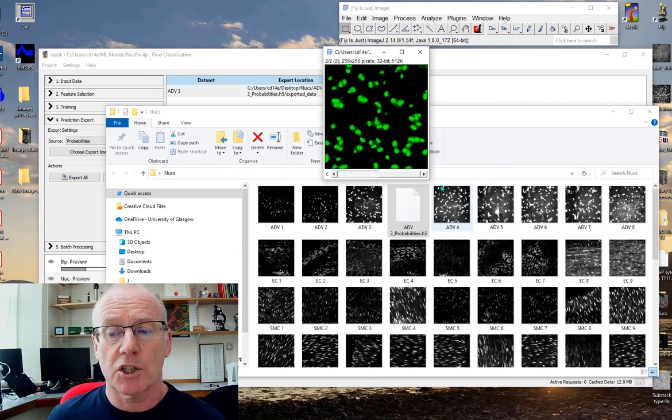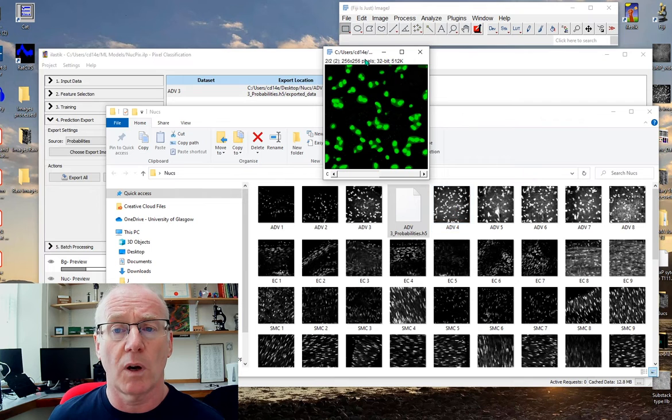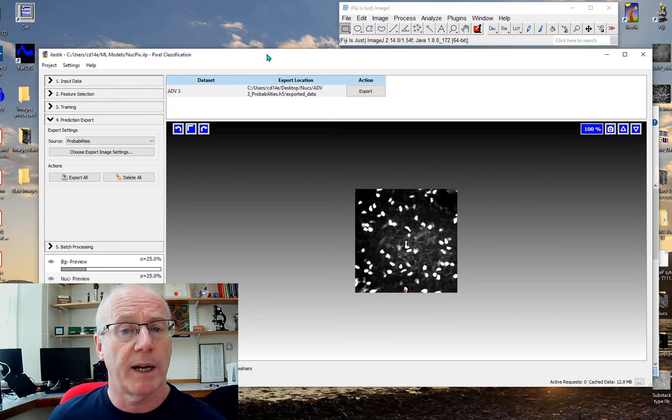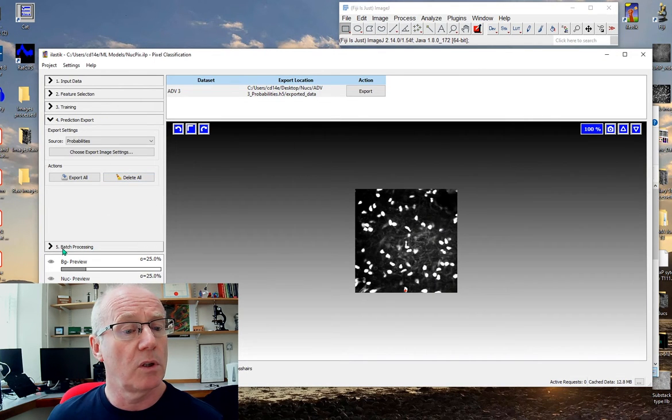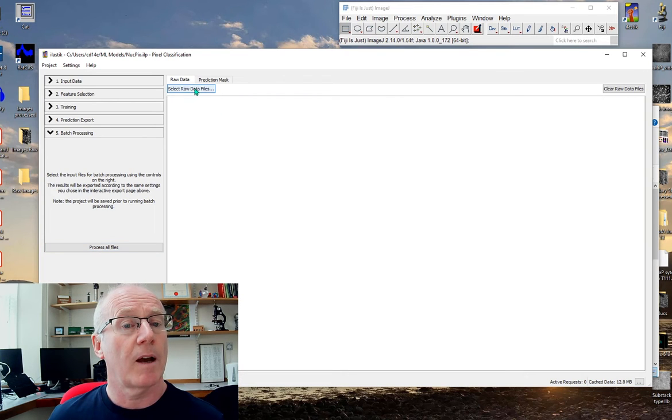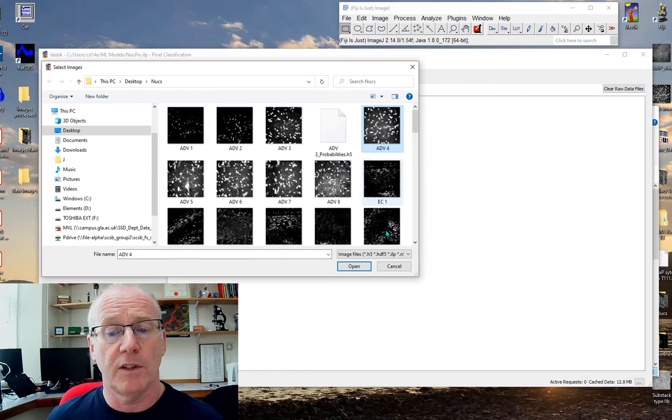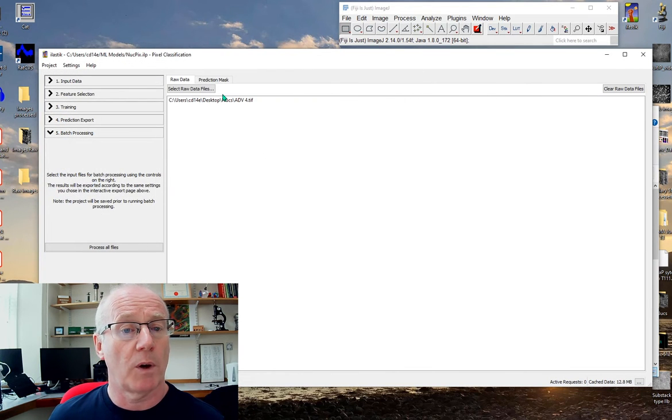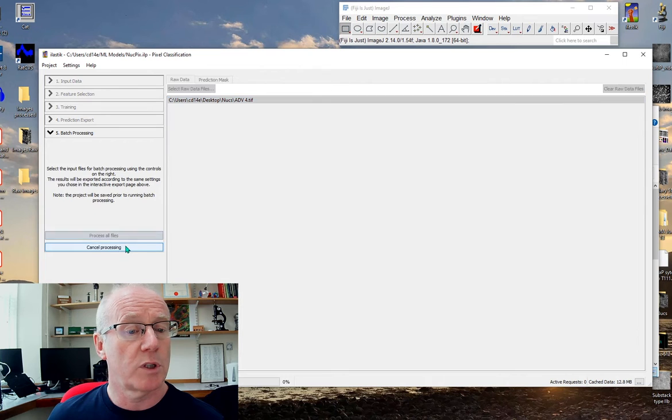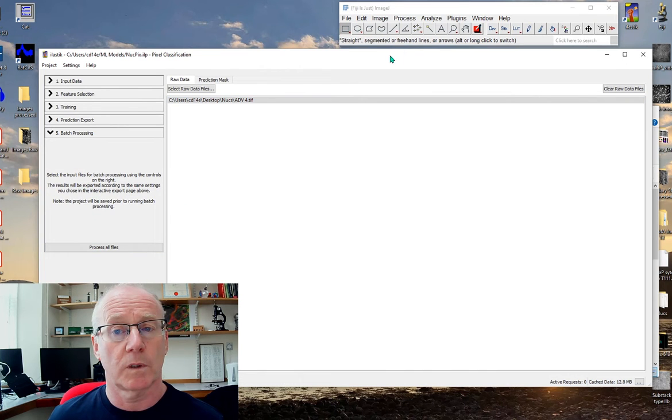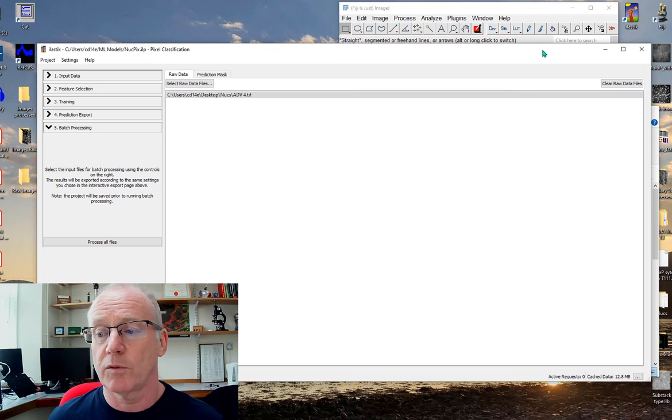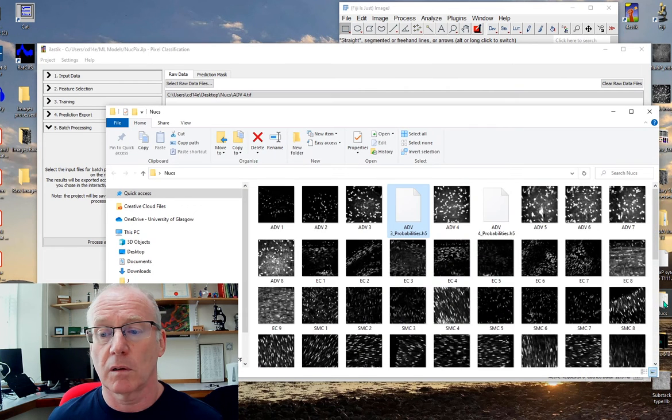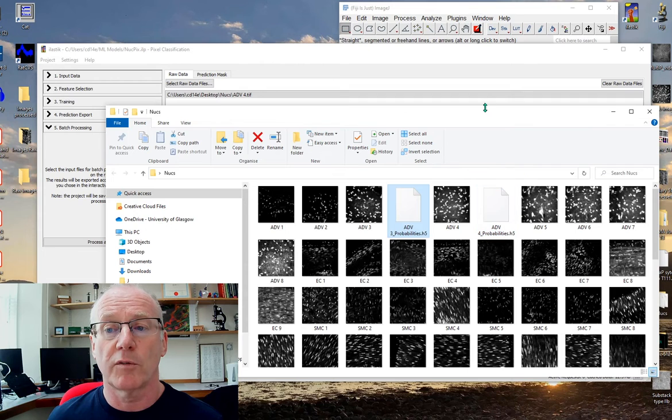Let's try this image here. The network hasn't seen ADV4, but let's go back here and we'll go to batch processing this time and we'll select a file that it hasn't seen, in this case ADV4. We'll open that one up, select it, process it.